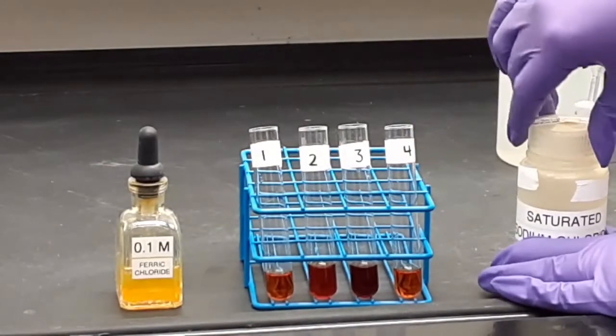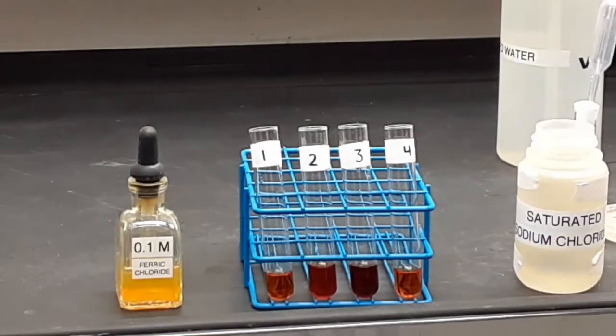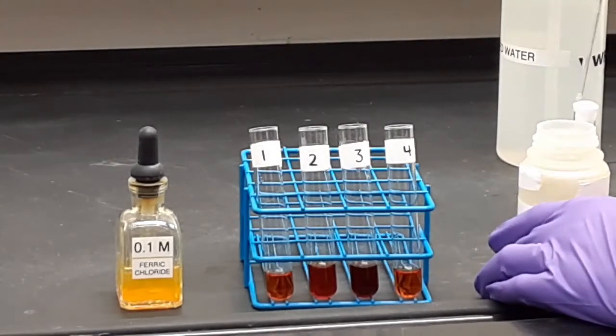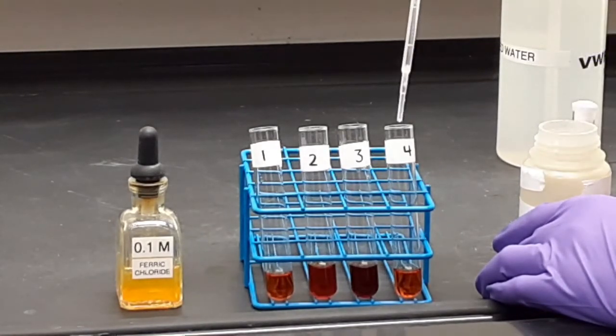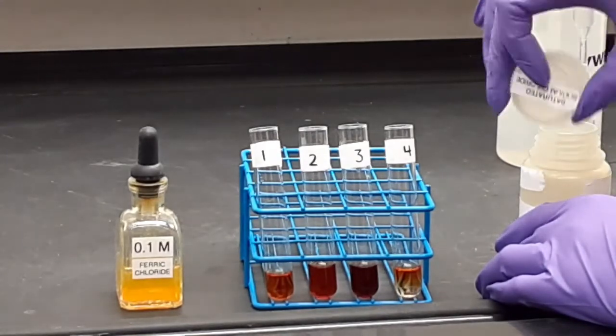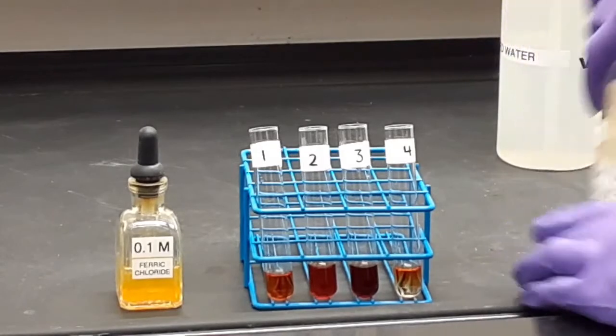Saturated sodium chloride. So keep in mind, this is at least 5 molar chloride, quite concentrated. In our next experiment, we'll do something with something even more concentrated than this.